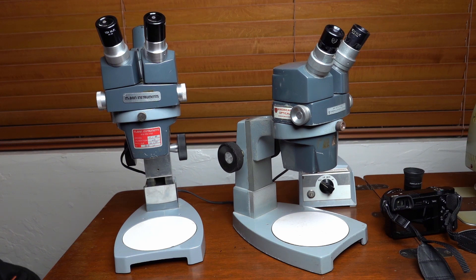I'll say something about these microscopes to begin with. When people ask me, my kids are interested in microscopy, what kind of microscope should I get, how much should I spend? I invariably say start them off with a nice stereo dissecting microscope. They're easy to use, they're pretty inexpensive, especially these old guys — you can get them for a few hundred dollars. You can start the kids off with something they can look at coins, jewelry, or bugs, and they get that stereo view so both eyes get engaged. They're just really wonderful microscopes to have around.